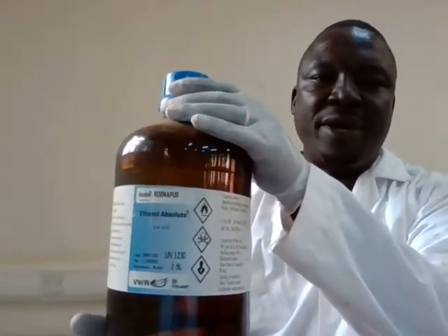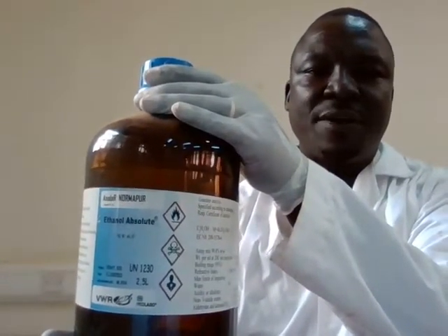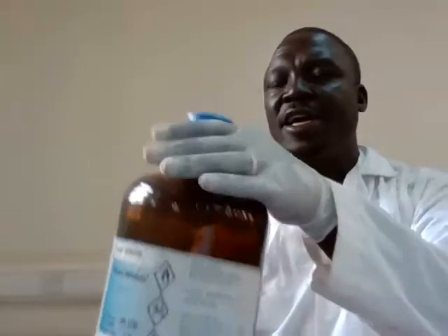And then also we have, say, here we have absolute ethanol that we will be using when you're sterilizing some of the equipment. You put in a drop of this and then you burn it until you clean the surface, sterilize the surface, so that you will be able to use that equipment without any contamination.